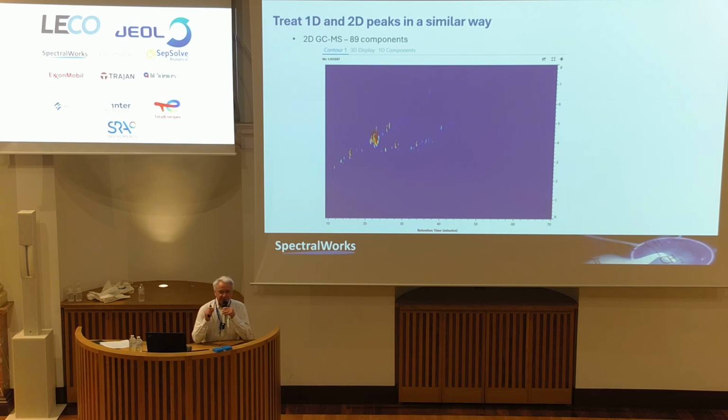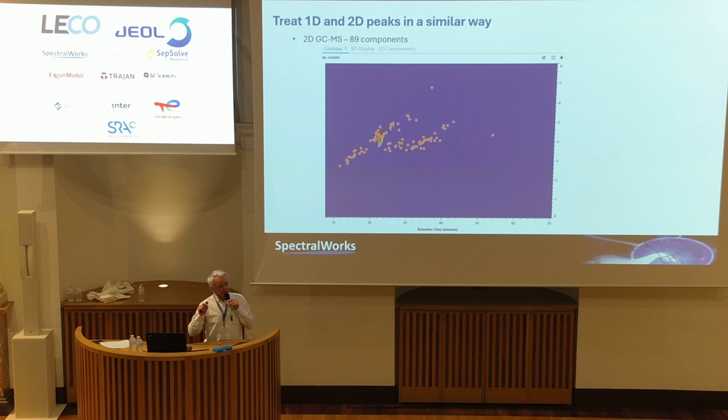Now what we do is we deconvolve these, we do the peak detection, we put them all back together again, and we actually get peak components. So we're treating it chromatographically. We're not looking at blobs, we're not looking at anything like that, we're looking at the actual chromatographic spectra.